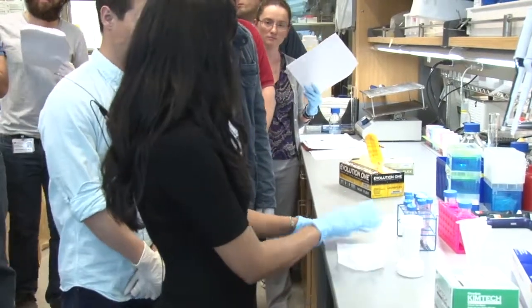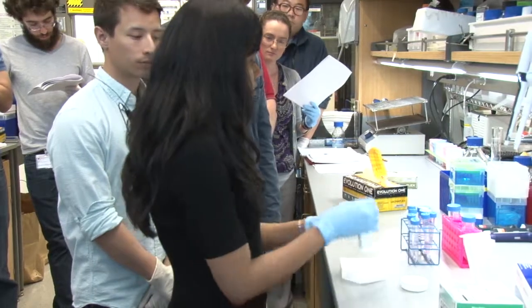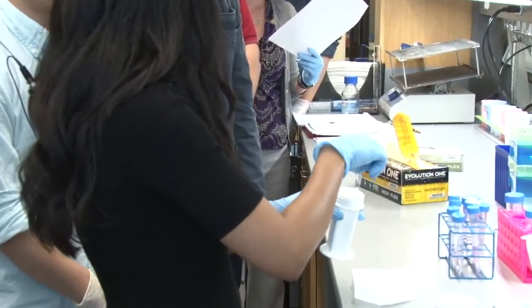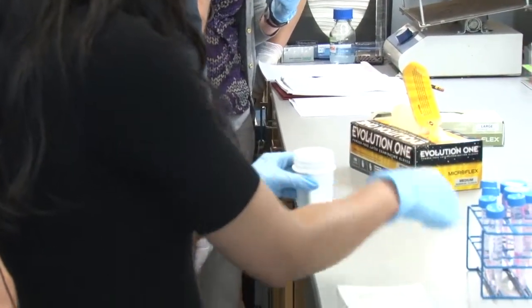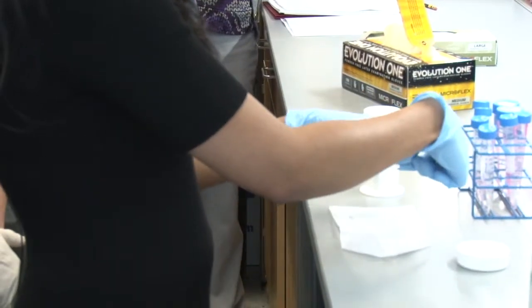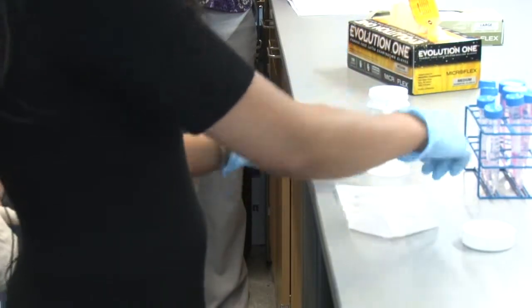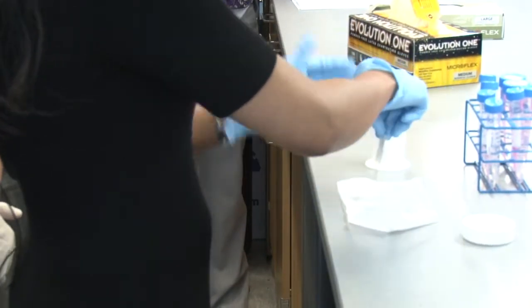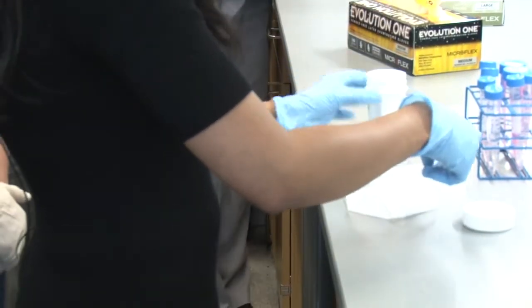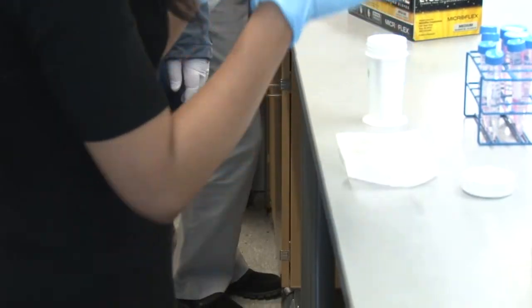Once you're done, you take your slides out and you need to make sure that they're completely dry. It helps that the slides were at 70 degrees, so the water tends to evaporate faster than just leaving them at room temperature. You can leave them like this, or keep them on an elevated platform inclined so the water just drips off and dries. The most important thing is to get rid of all excess moisture, because you don't want any liquid in there when you put on the seal chambers.